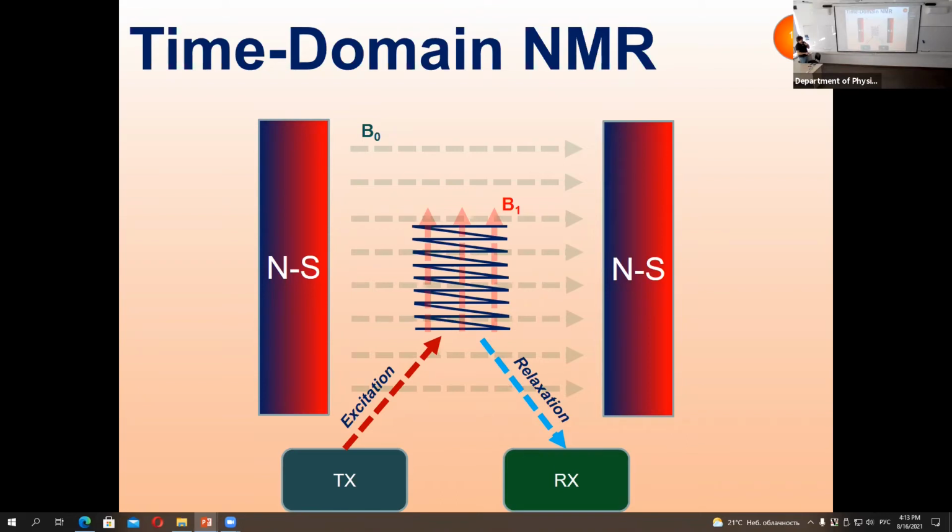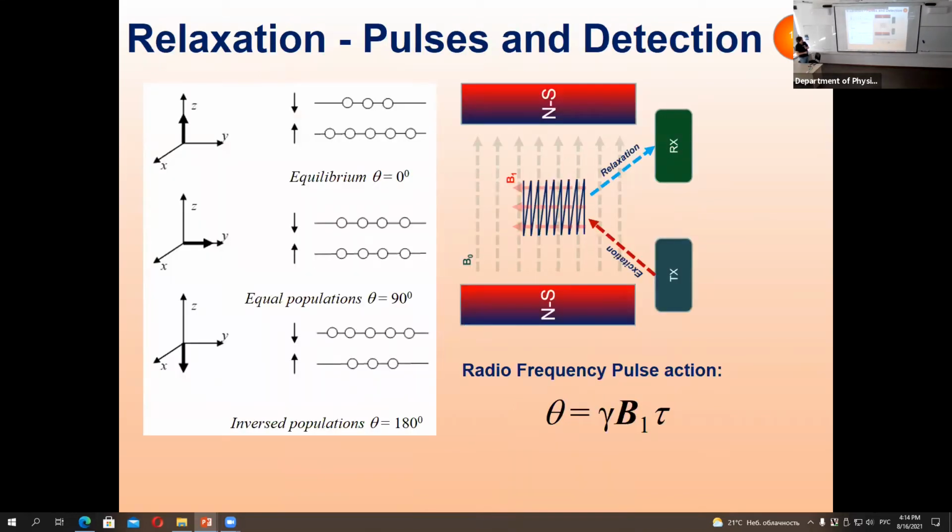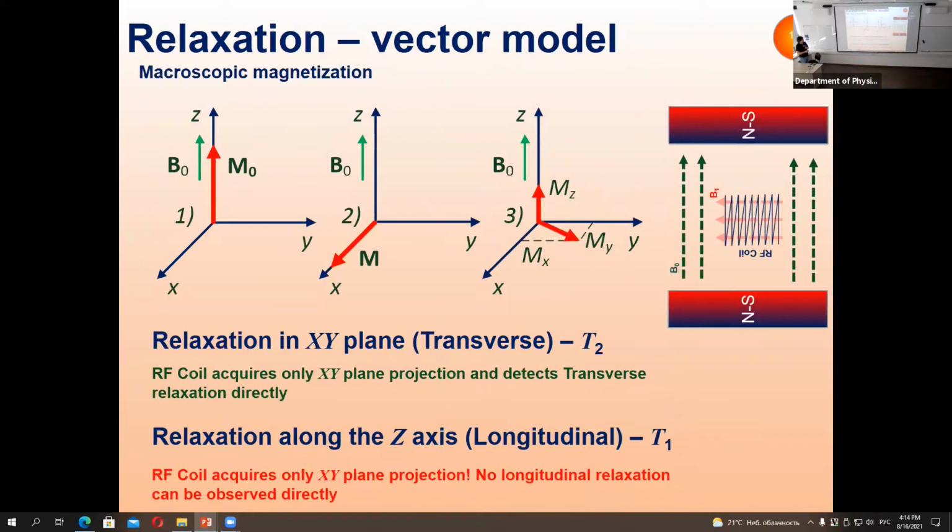Well, we were talking about voltages. So here from the transmitter, kilovolts; here we have microvolts. That's why these devices were really not easy to build. Now technical progress and technology are evolving, and we can see many changes. These devices are becoming more and more available, more affordable. It means that you are able to use them more. So I think I will not talk about magnetic resonance. If any questions arise, I will answer them. I will talk about what we are doing.